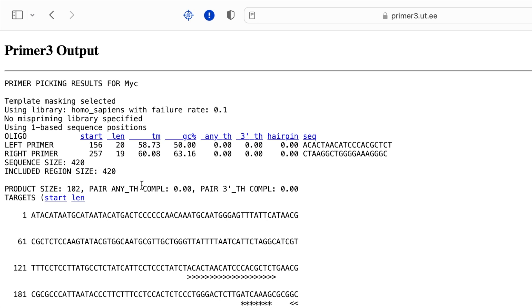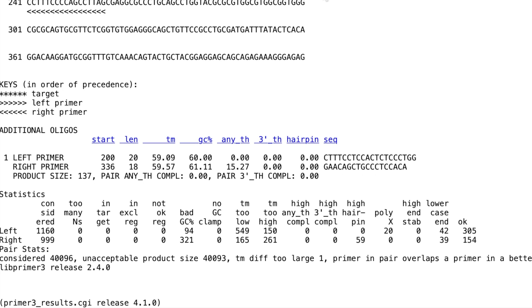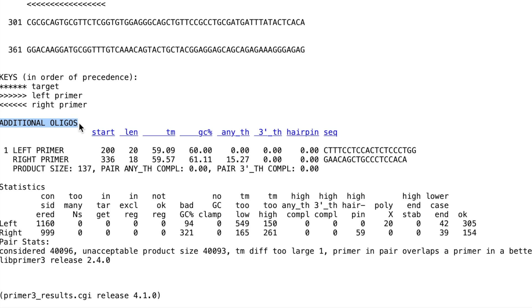The result output provides the left and the right primers. The details include the sequence starting point, length of the primer, melting temperature, GC percentage content, potential secondary structure information, and the sequence of the primers. The result also provides the product size that would be amplified by these primers, including other information of the product. In the promoter sequence, the star marks highlight the specific sequence of the LEF1 binding site. The greater-than symbols mark the forward primer sequence and the less-than symbols mark the site for the reverse primer sequence. Additional primer sequences are also provided by the software, all designed to flank the specific sequence site.